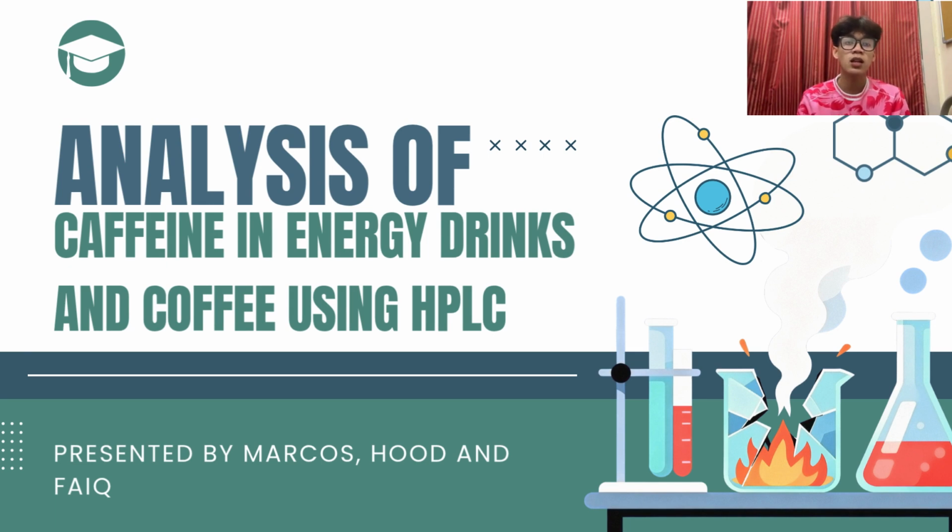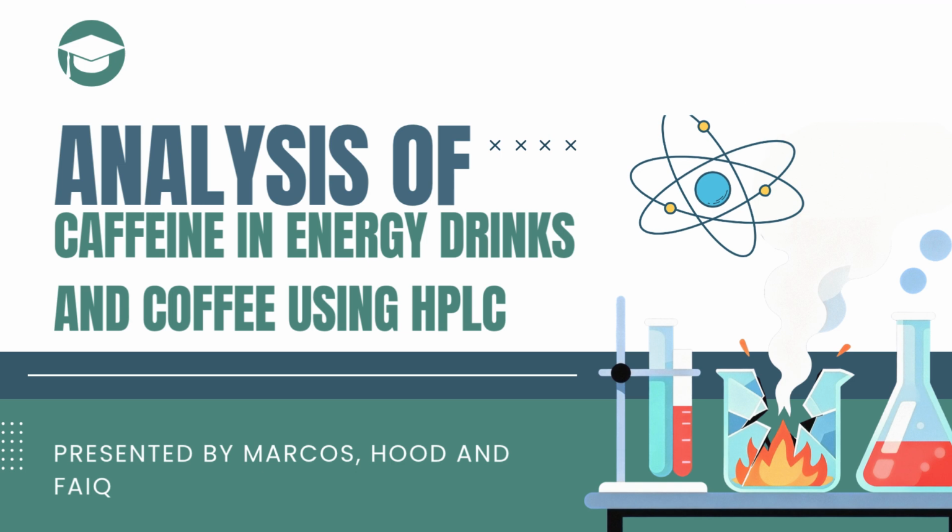Today we will be presenting our topic about analysis of caffeine in energy drink and coffee using HPLC, or the long term is high performance liquid chromatography. My group members are Hood and Faik.